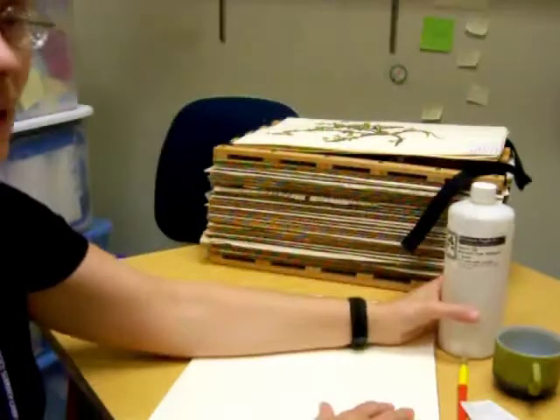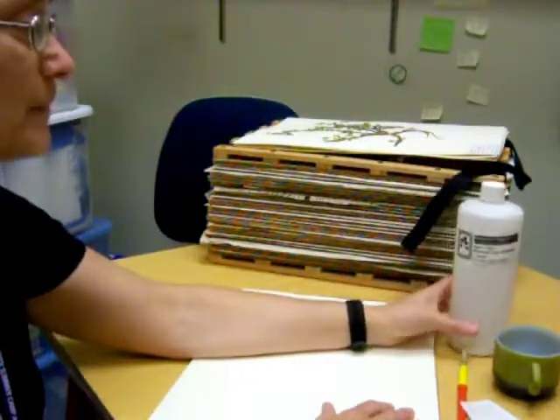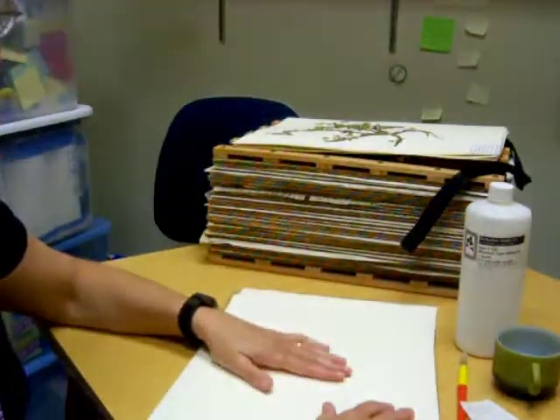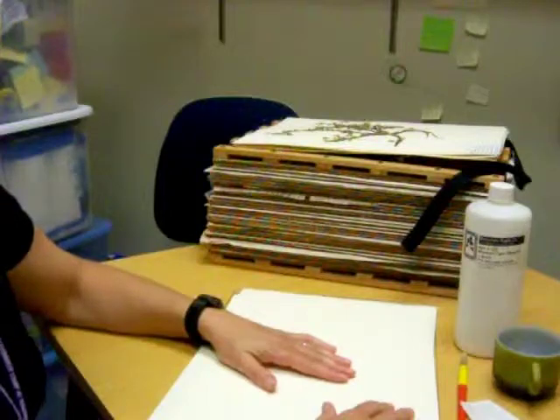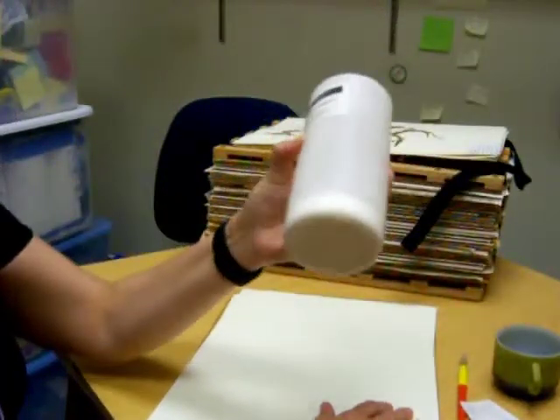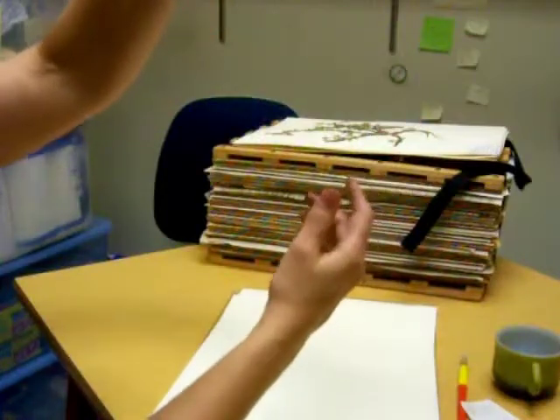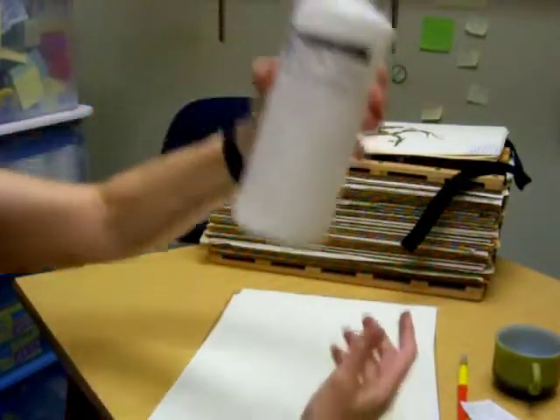Likewise, this glue is special for use in herbaria and designed to preserve specimens and affix them to the paper without damaging it. This glue is pretty thick, as you can see, so it probably needs to be thinned with some water — not a lot.